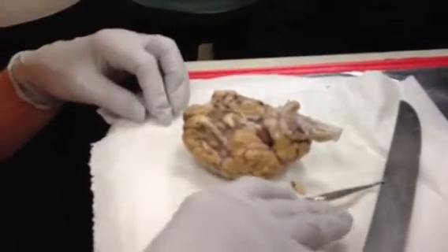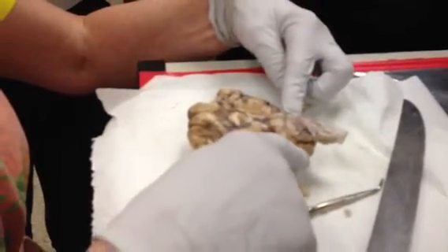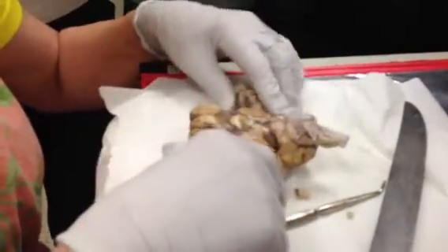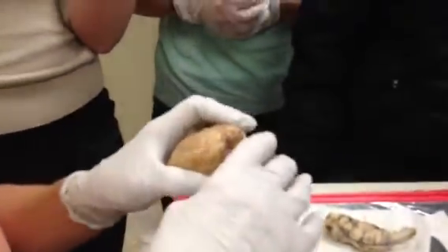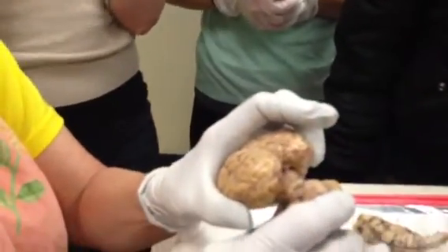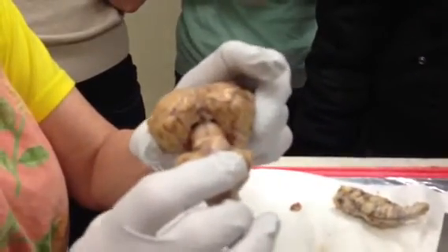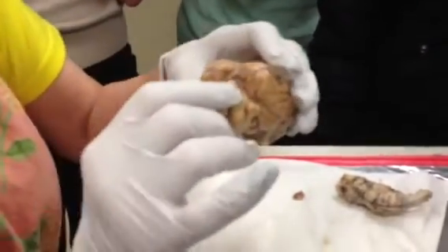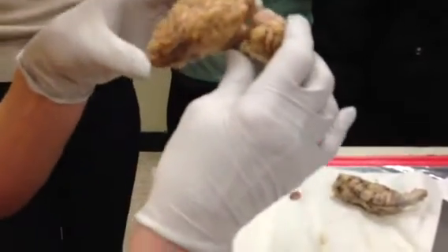Okay? The next thing I'm going to do is I'm going to actually, this is your cerebellum. We've already talked a little bit about that. And we do have a transverse fissure. There are baby's bottoms, the superior and inferior colliculi. And which one is bigger? Superior. The superior actually looks like the baby.